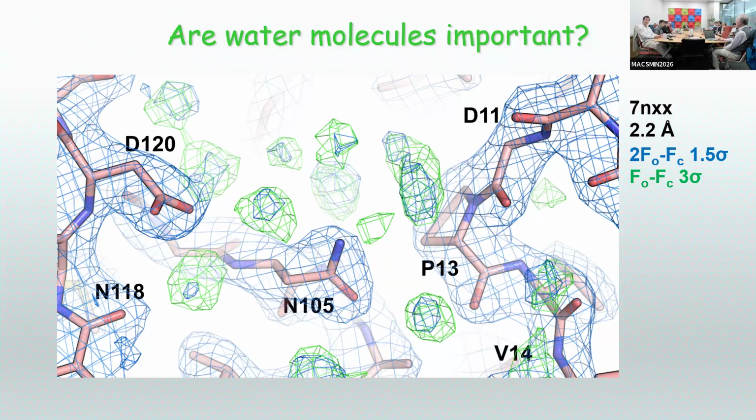on doing it at room temperature, and they referred to a structure showing that the very important water was not present in the structure, which was done under cryogenic conditions, and it was present at room temperature structure. And you looked at the structure, frozen crystals, and there was beautiful density for water. It was just not modeled. So there is a paper which interpreted that structure without looking at it.